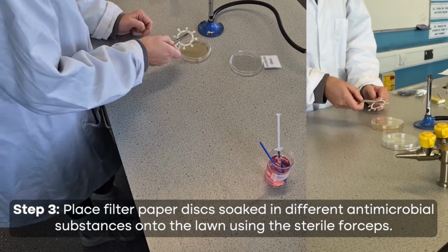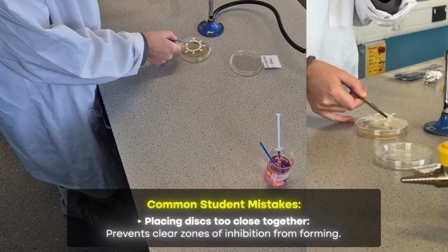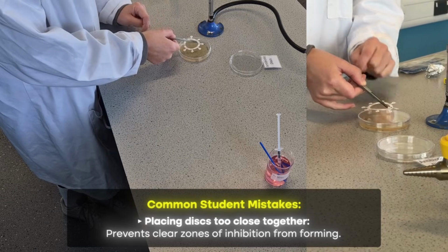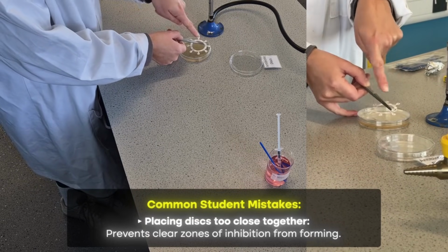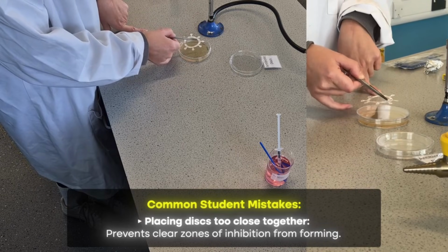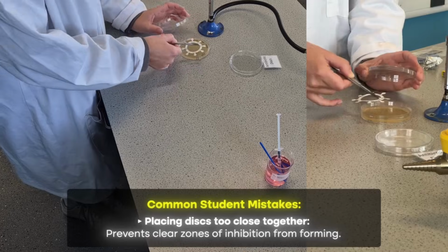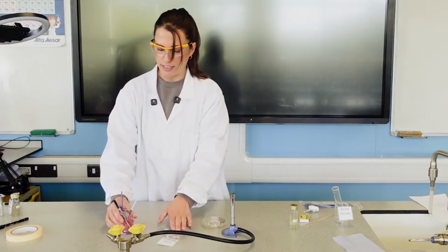And this is where we get a common mistake students make, that once they put it down, you need to put it down correctly the first time because the antibiotics will imprint straight away and it affects your inhibition zone. And you don't want it too close to the edge so that you can't get a circle. That is the inhibition zone. So I need to lift this up and make sure I place it right in the middle, which is the tricky bit. And then those forceps go into our disinfectant.